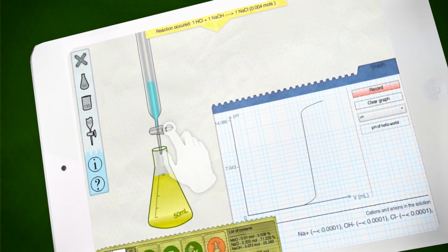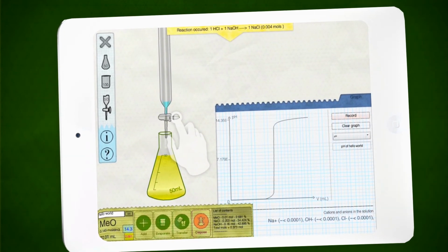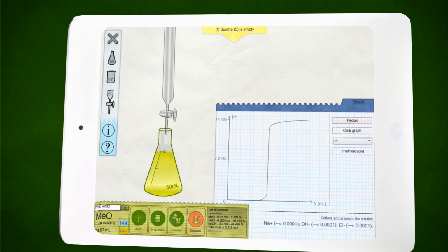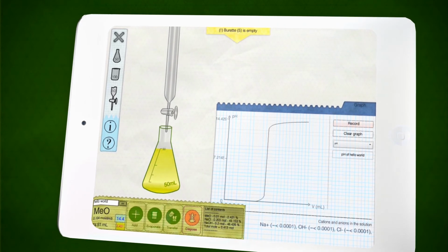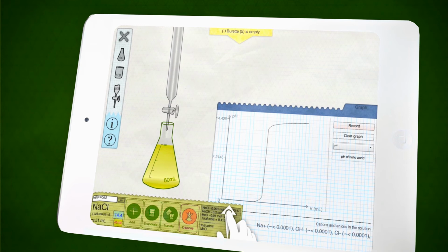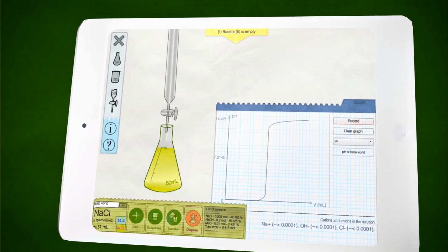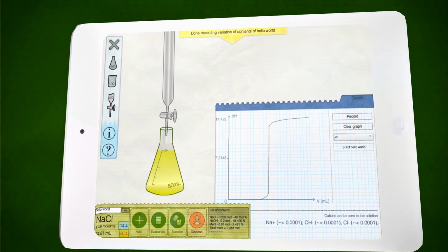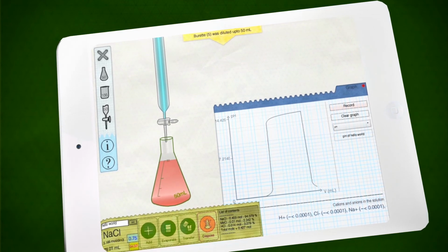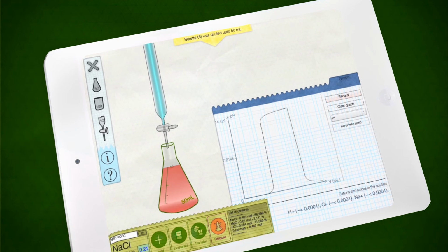If any chemical reactions are detected, they will show up in the message box above. You can see all the salts formed, and mole percentages in the list of contents. You can also back titrate, or experiment as you wish. It's your experiment after all.